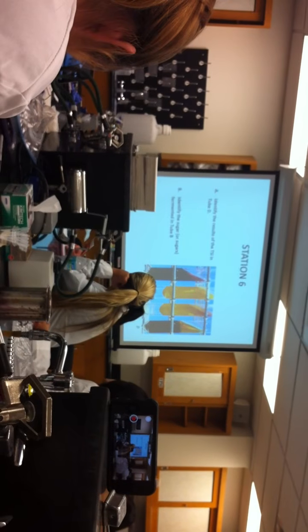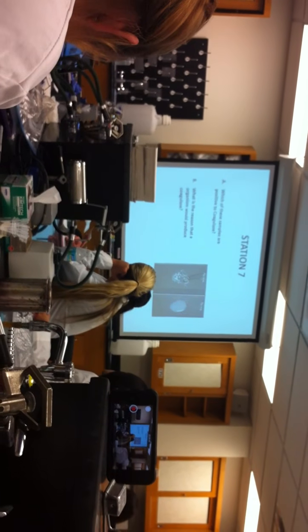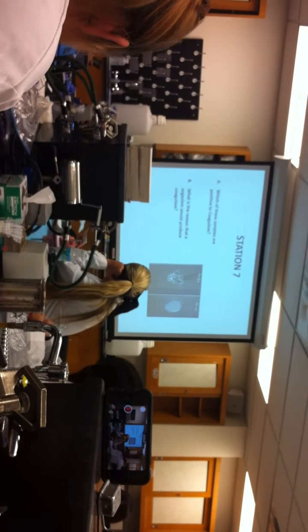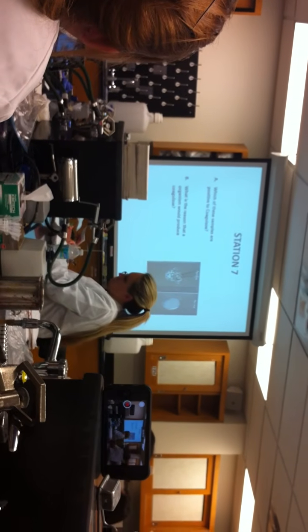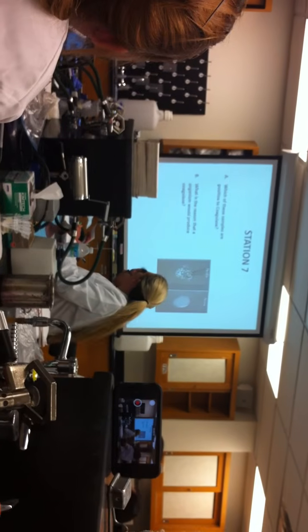Okay? No problem. You guys got to remember coagulase, okay? We did this. Why would an organism produce coagulase?